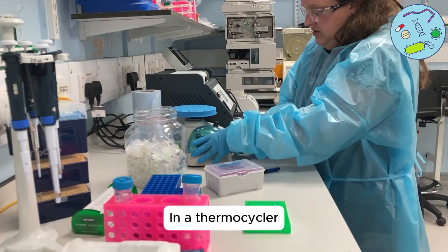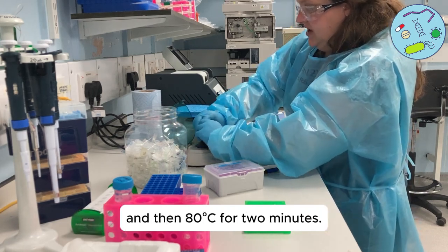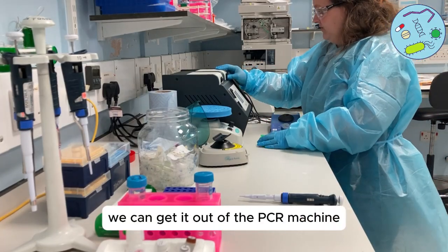In a thermocycler, incubate the tubes at 30 degrees for two minutes and then 80 degrees for two minutes. Once that's finished, we can get them out of the PCR machine.